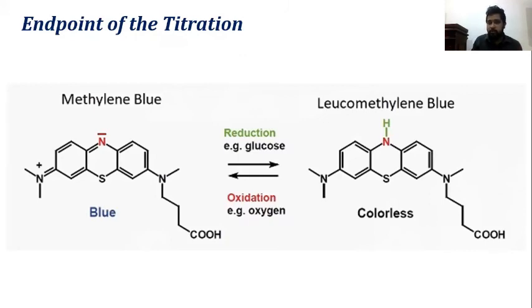So to do the calculation, we have to get an endpoint. If Cu2+ is responsible for the Persian blue color, can't we assume that when the sugar solution has totally reacted with copper ions, the Persian blue color is totally removed and it turns colorless in the Fehling solution?